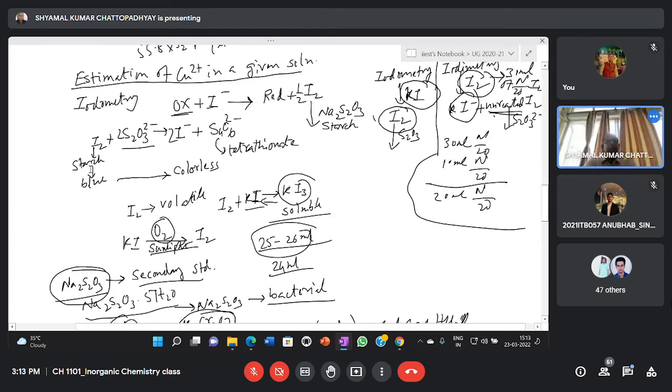Now here, for iodometric titration, you must take several precautions. First precaution is that iodine is very volatile, and so you must take care that these titrations are carried out very rapidly, and usually these titrations are carried out in long-mouthed conical flasks, so that the iodine volatility decreases. In a beaker, because of its very open mouth, it can easily go out. But if you take a long-necked conical, then iodine will go out slowly, and you must do these titrations very fast.